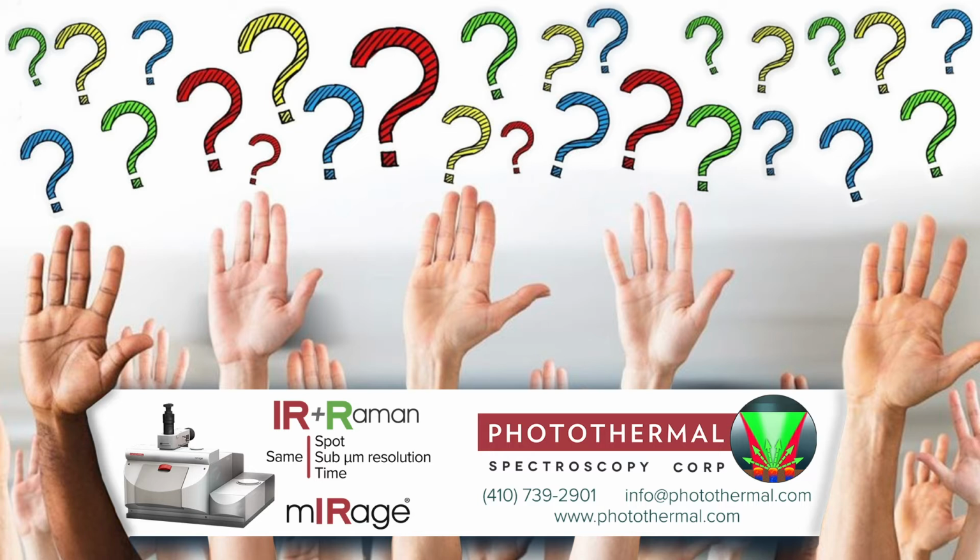But yeah, I want to stress something you said there. I call it the upside down sandwich. Because the infrared is coming from the top, having the cells on the top window hanging upside down is critical. The infrared will hit the cells first without having to travel through water first, as it would in the non-upside-down direction. I think that's a big factor in minimizing water.